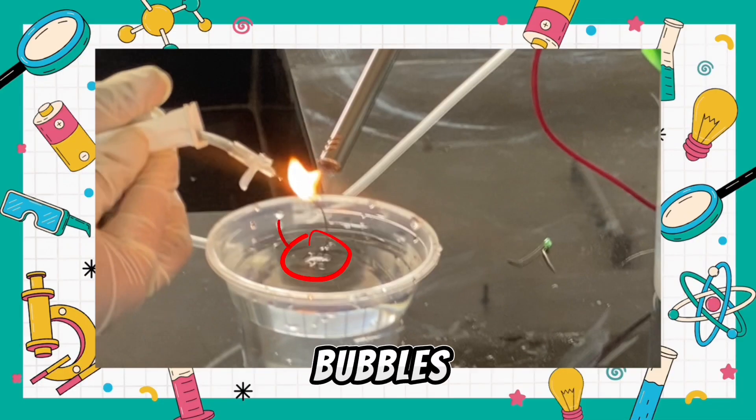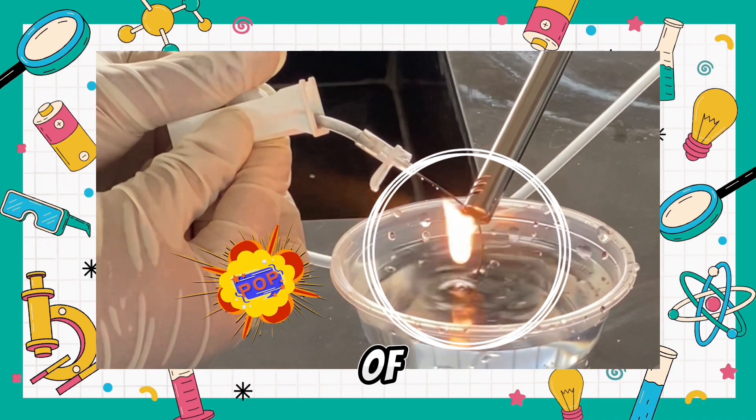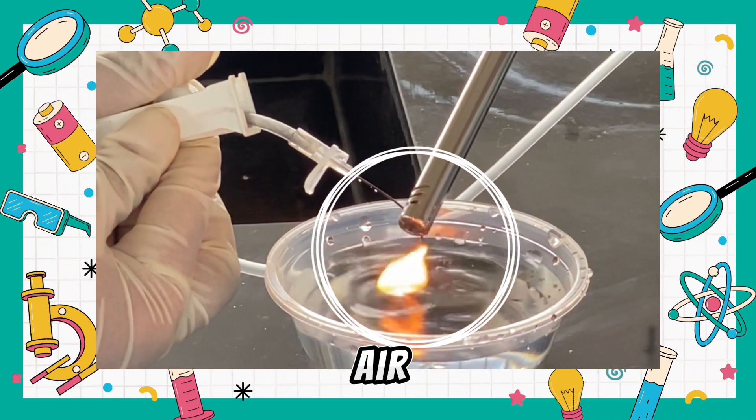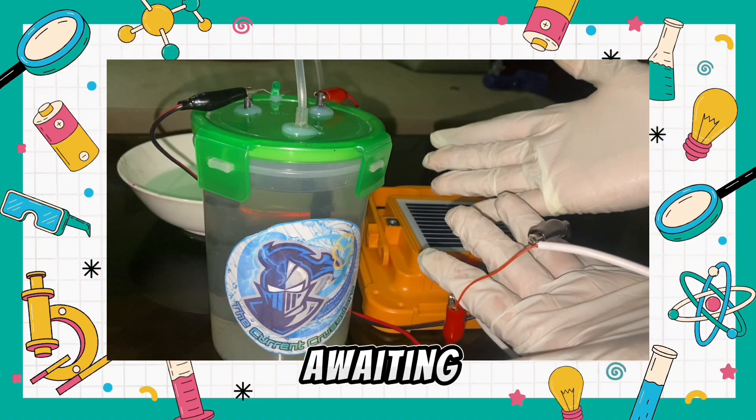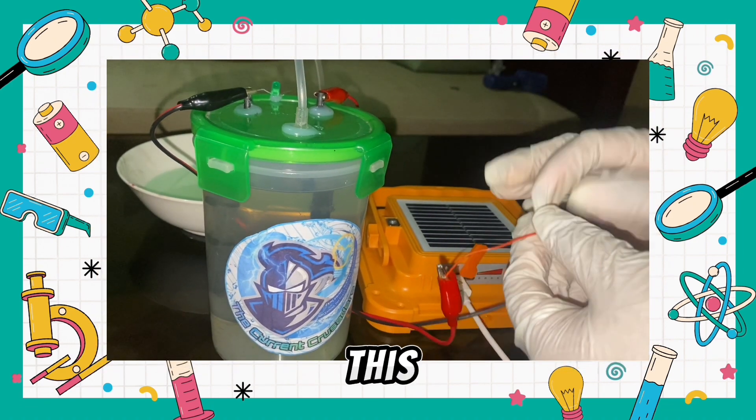When these bubbles ignite upon coming into contact with an open flame, they burn rapidly in the presence of oxygen from the surrounding air, which results in a distinct popping sound — the most awaited part.